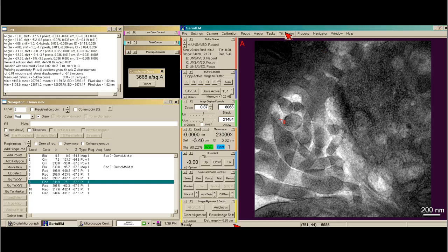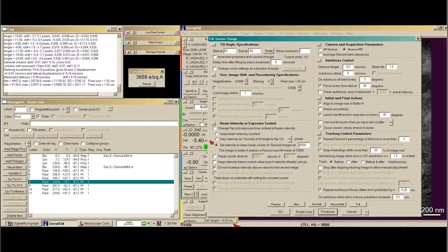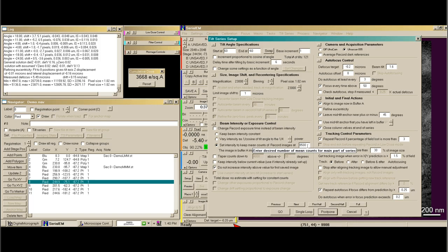Now let's set up a tilt series. You go to tilt series and say Setup Start. Here we get a big dialog box, and we'll go through each portion. First, you need to choose your tilt angles — you can start at either minus or plus, and set the increment. You can add a delay time after it tilts before it takes the final record image; I have six seconds because it's a heavy holder. Here you can double-check your magnification and binning, and it tells you the pixel size, which we like to be about a one-nanometer pixel. For beam intensity control in plastic tilt series, we typically try to get the intensity to be at mean counts of 8,500.